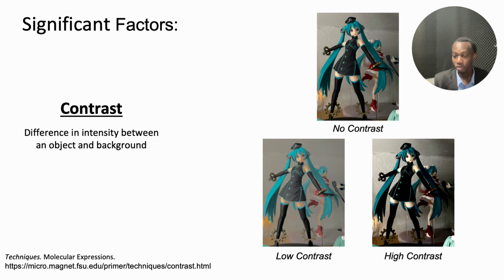This is very useful in studying the internal workings of a cell, which is in turn helpful for studying how diseases form and things like drug design. The earliest documented forms of microscopy date back to around 1000 AD, but the first real microscopic attempt was around 1600 when a microscope was used to study microorganisms.